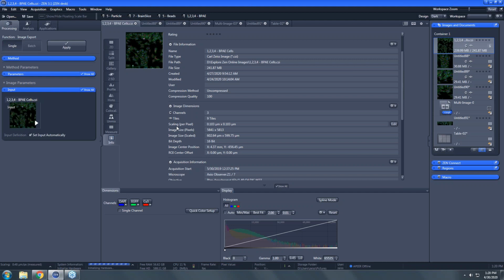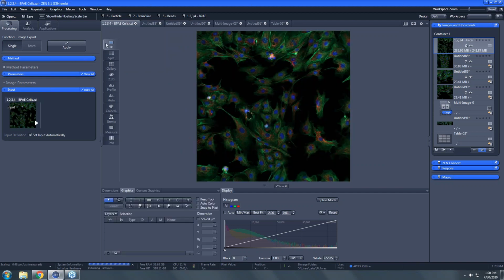If we go to the 2D version of that image, we can answer one of the other questions, which was how to set in a scale bar. So Nicole, we've got a scale bar entry there as one of the annotations. There you go. Yeah, you'll always see it here as the mini ruler in the graphics.